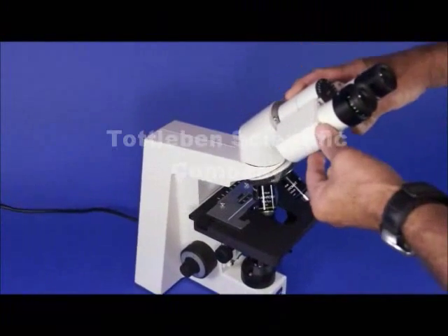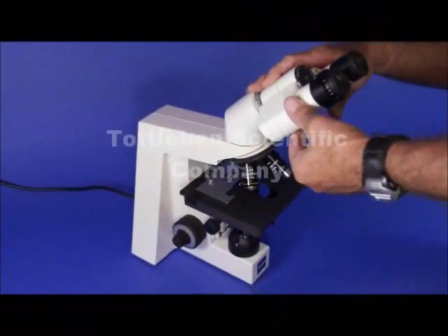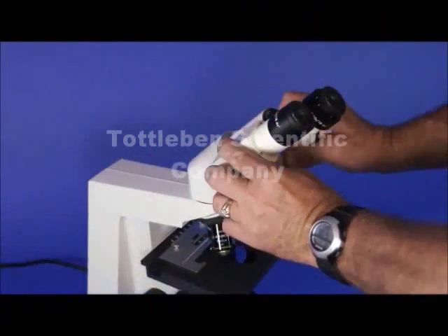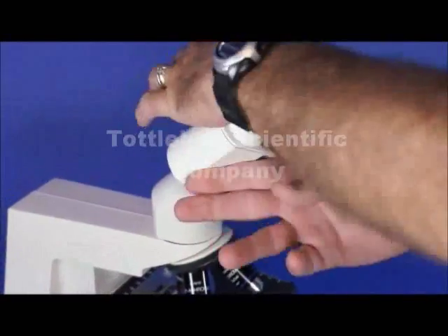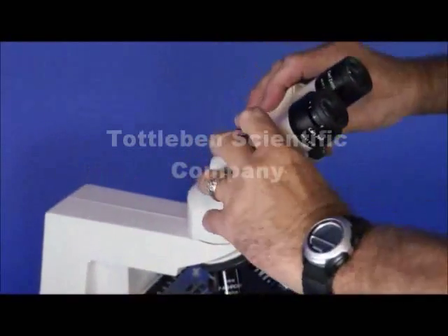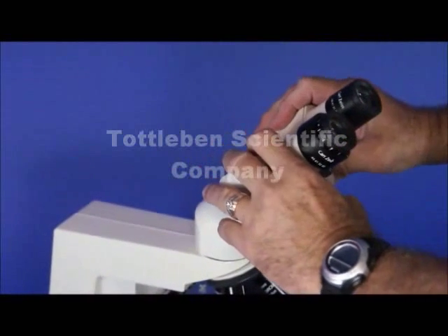A couple of really nice things about this Zeiss Axiostar is that this head rotates 360 degrees. The way this really works and the way it's really advantageous is, for example, if you were looking for an inclinable head.